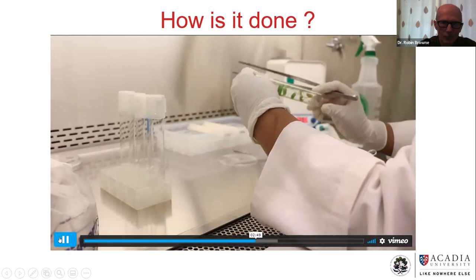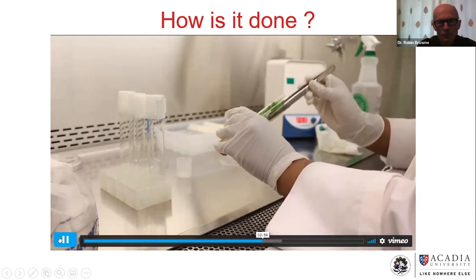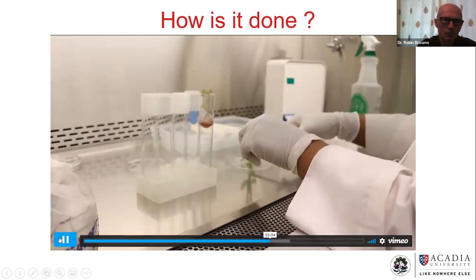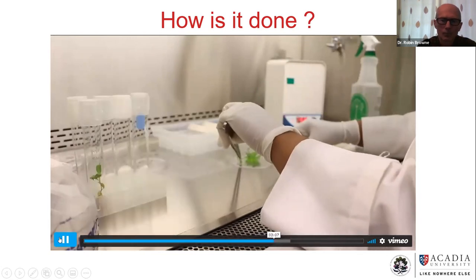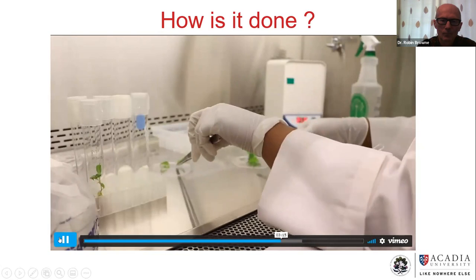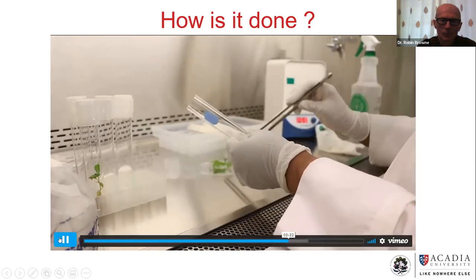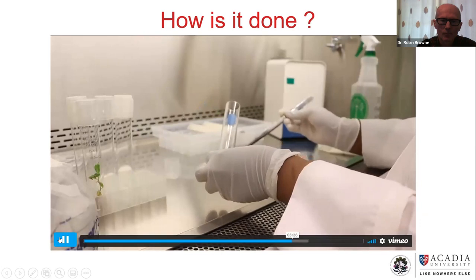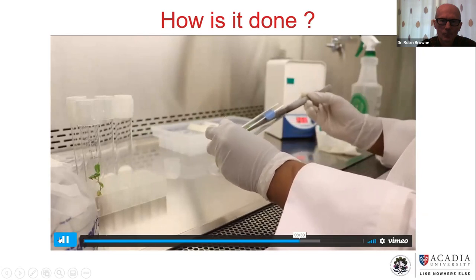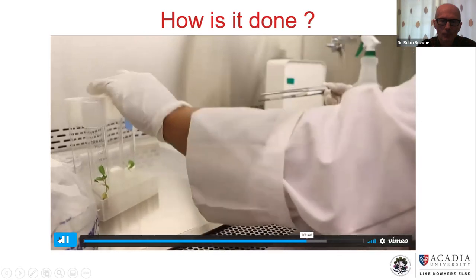After sufficient growth of stabilized cultures has been achieved, usually in 2 to 3 months, the multiplication stage can begin, whereby sections of the original cultures are subdivided regularly and recultured. The process can continue indefinitely to build up large populations, which can be done year-round in a controlled lab facility. Repeated transfer cycles can yield very large numbers of plants if desired. In this example with willow, 4 progeny cultures were produced from the 1 original culture. If this level of multiplication can be sustained consistently from a starting stabilized culture population of 10, then a resulting population of over 40,000 could be achieved in 6 months. In several labs around the world, millions of plants are produced this way every year.